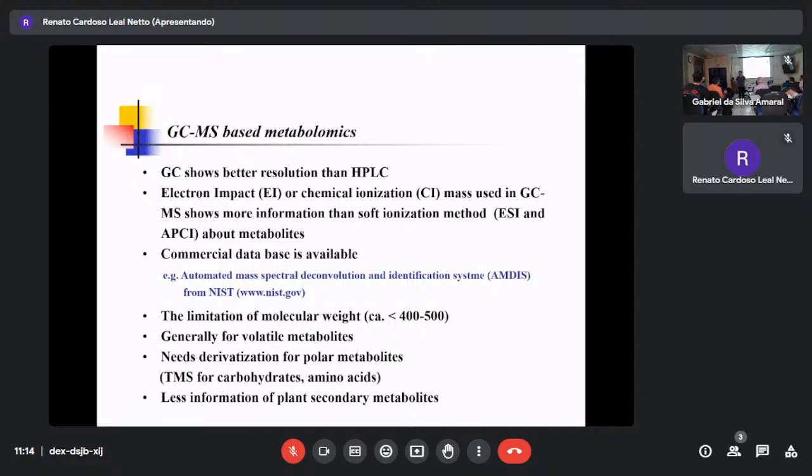They reduce the pressure, which means the boiling point is going down. So even if it is a liquid at atmospheric pressure, when it goes into the GC column, it is a very low pressure, so it becomes volatile.